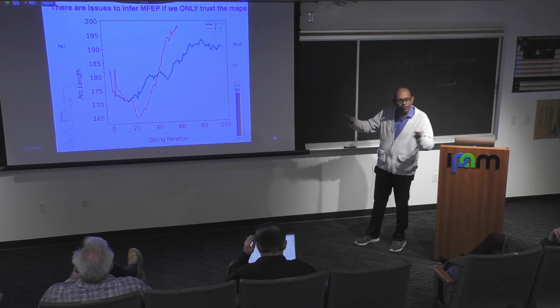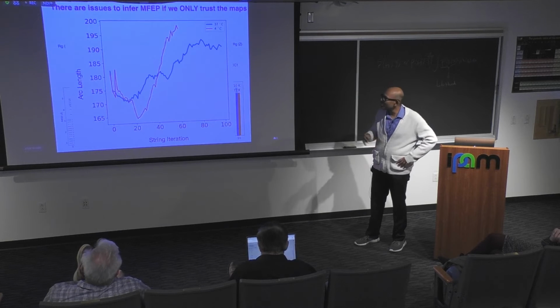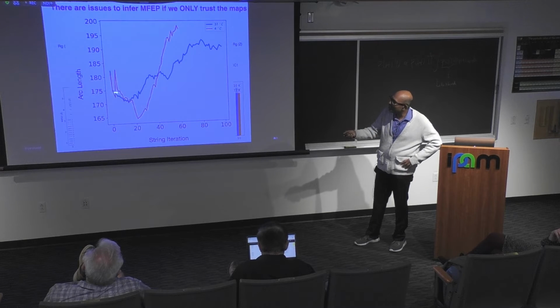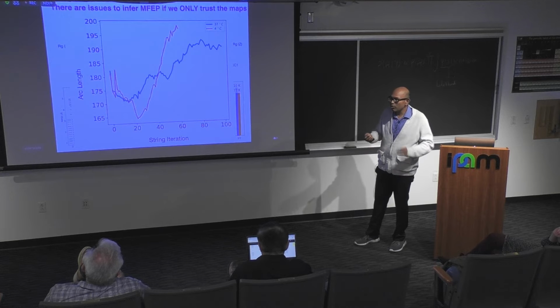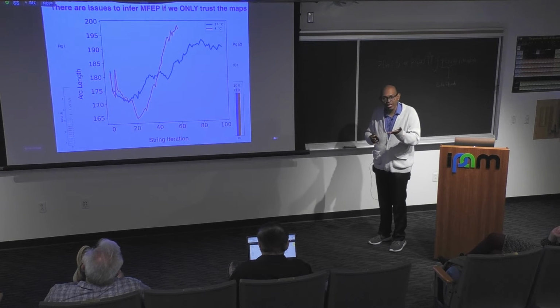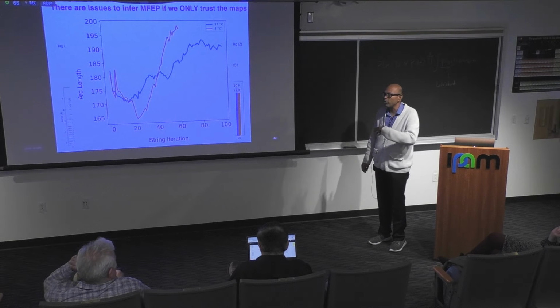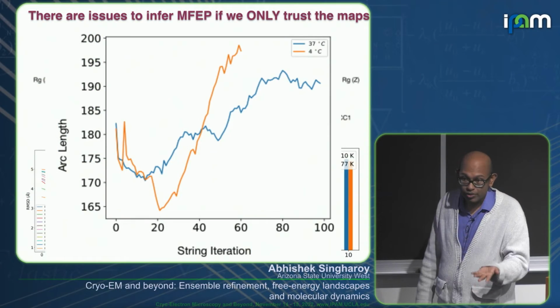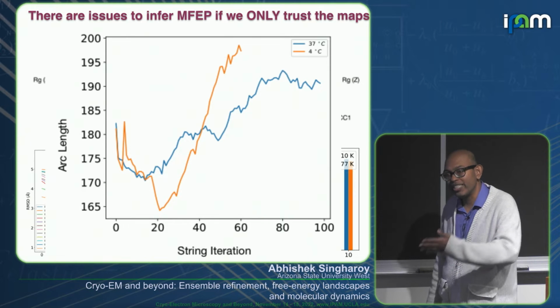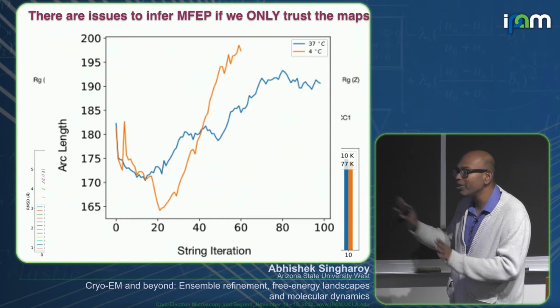If you take the length of these pathways, the arc length, this pathway is a very weirdly contorted shape in this n-dimensional space. The length of this pathway starts out, let's say, at 175 angstroms, and this grows after doing string simulations by 10%. So it is not like what we are seeing in cryo-EM. At least for this one example, I can't say more, but it need not be what we call a biologically relevant or a minimum free energy pathway. It is a faithful treatment of the data, to the extent we do all the things right. But after that, biology is doing something more to it.